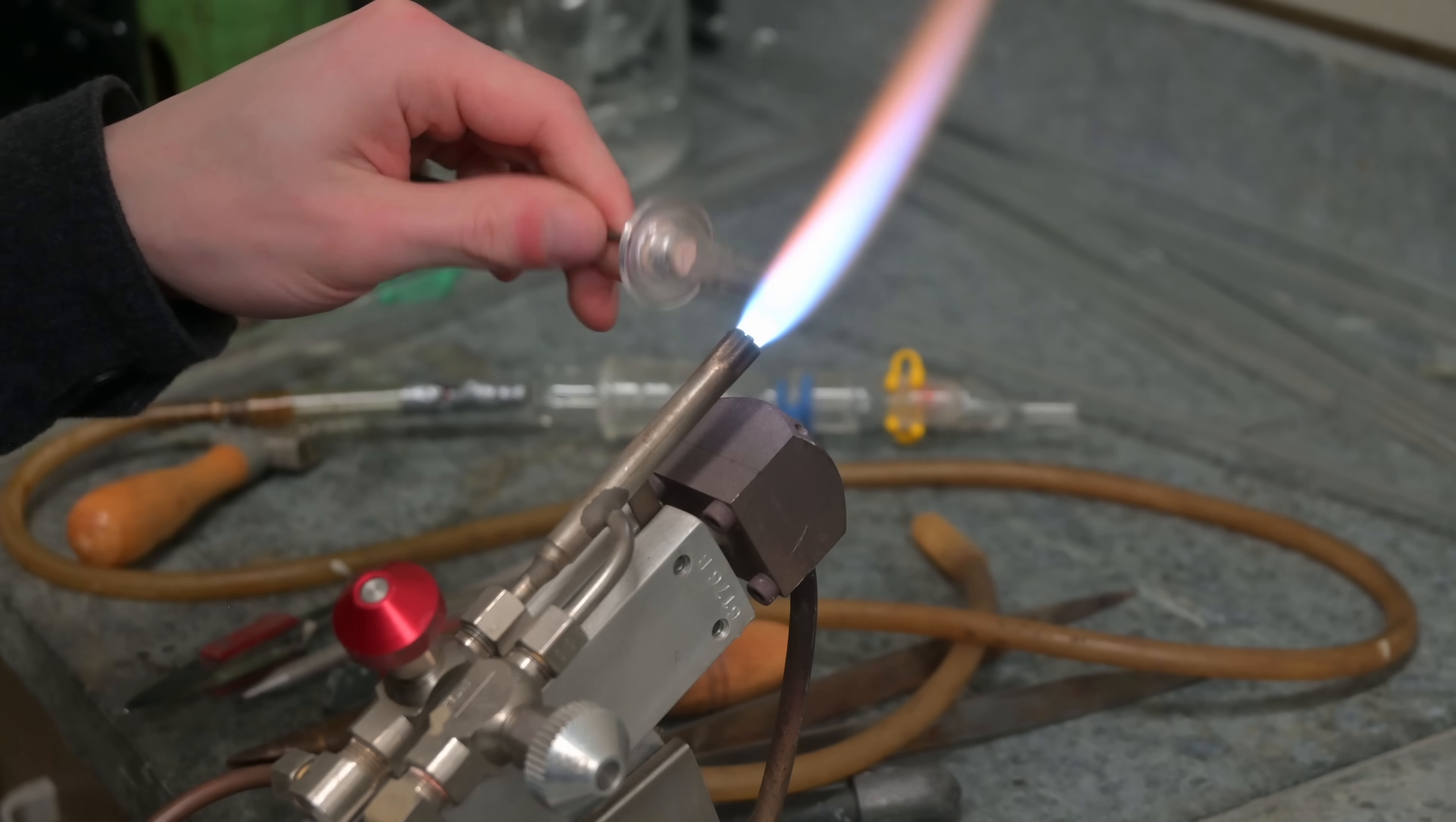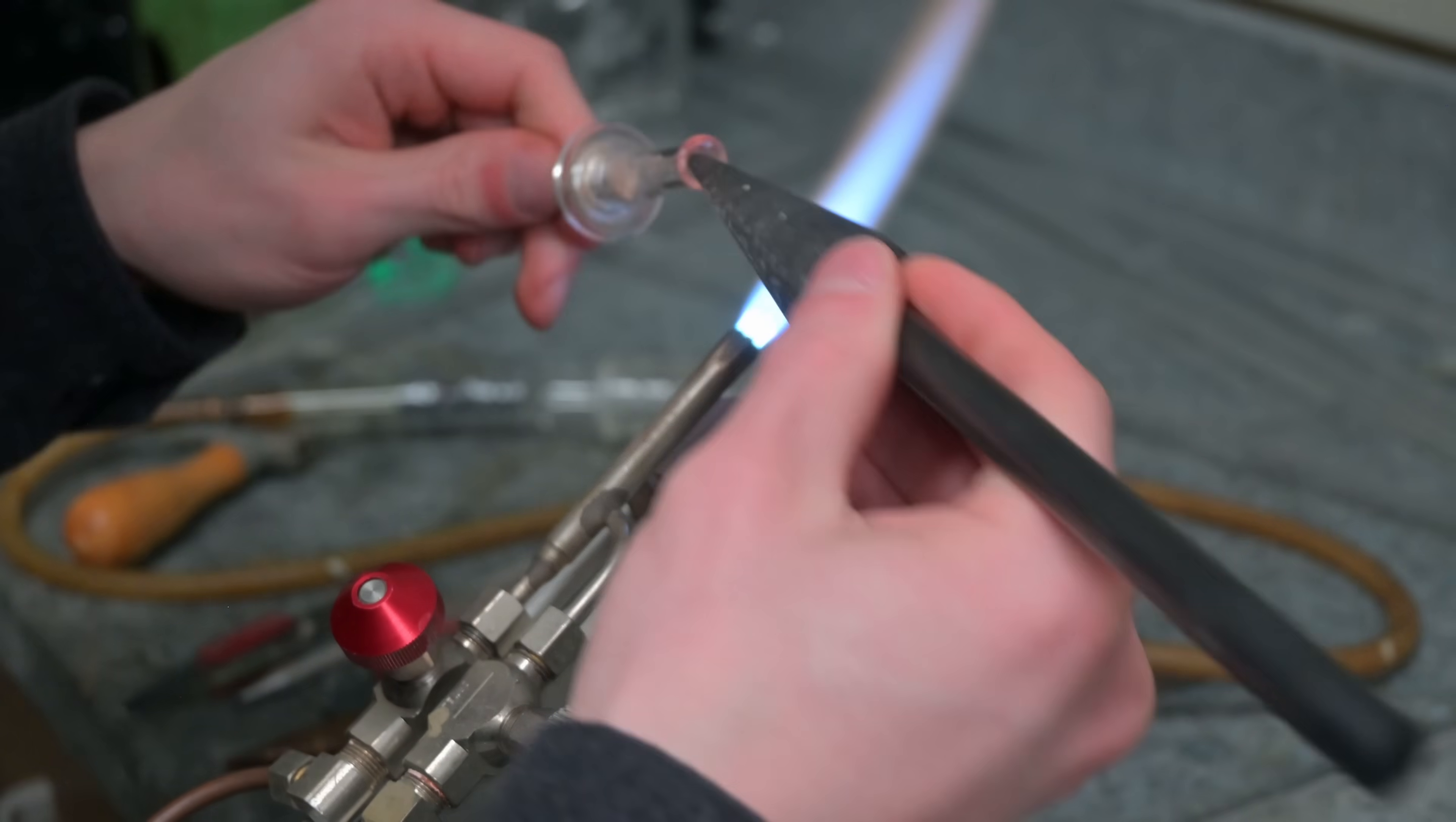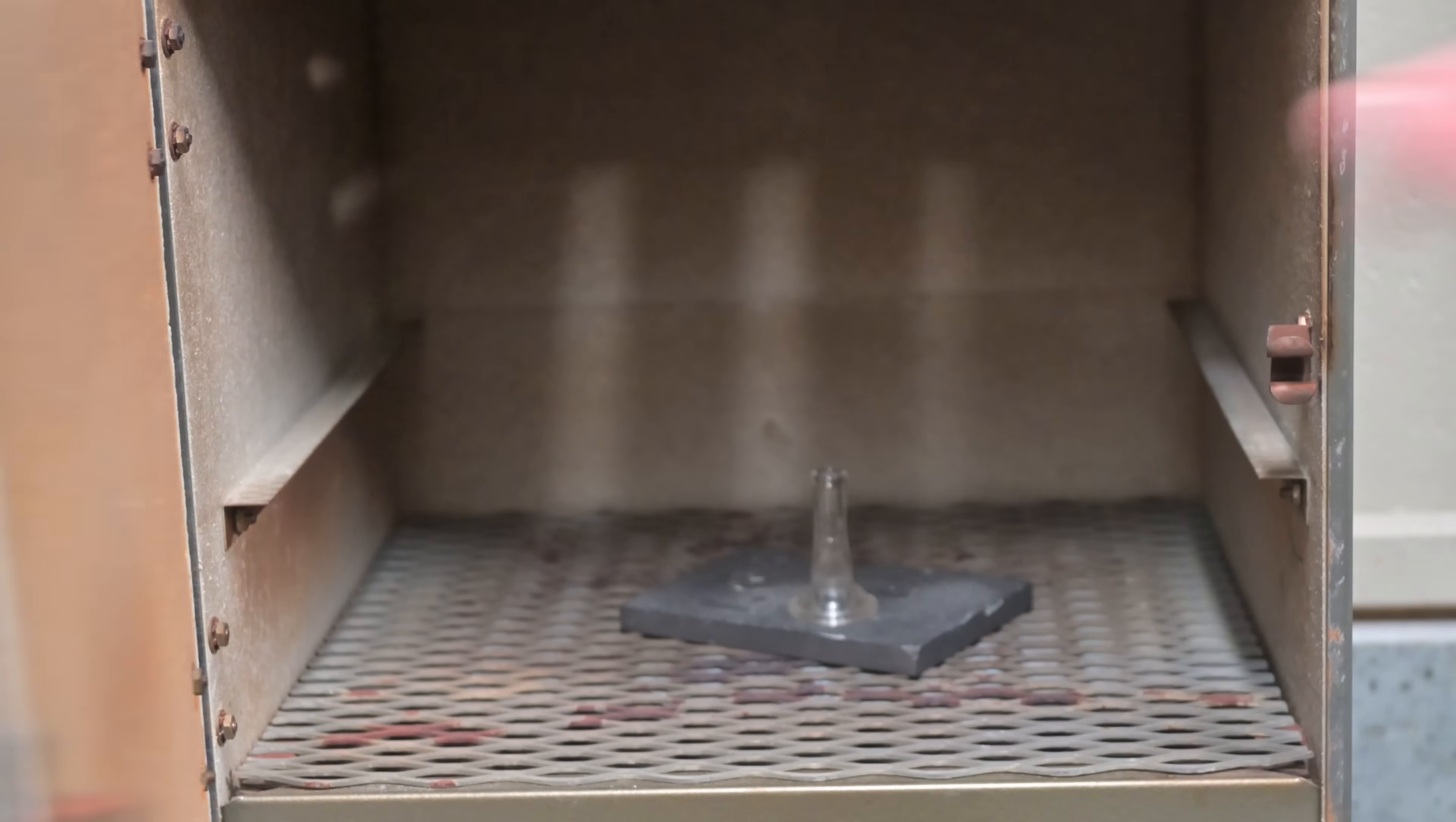Next, we make the thermometer adapter, which is the easiest to make of all. All I need to do is heat up the end of an o-ring joint section and flare it out so a thermometer adapter sleeve seals on it properly. After flaring it out, I throw it into the oven to cool down slowly.